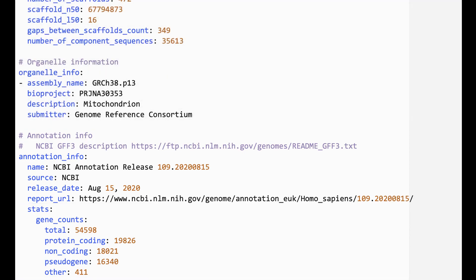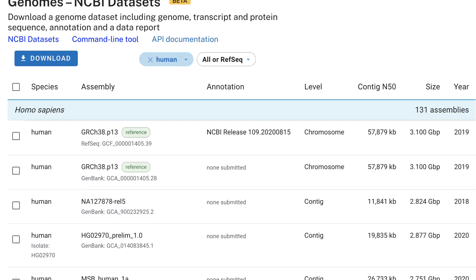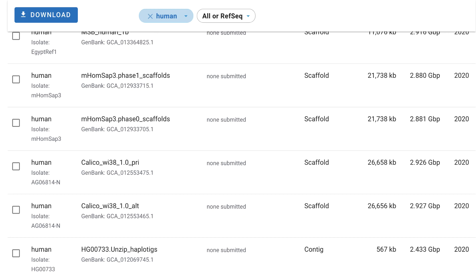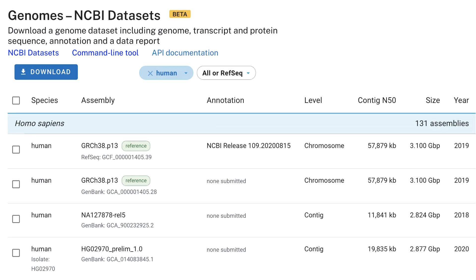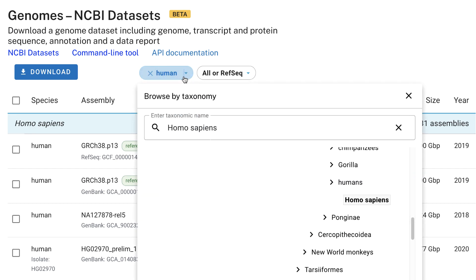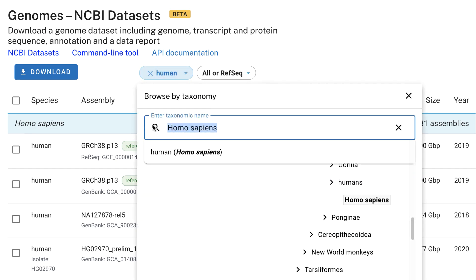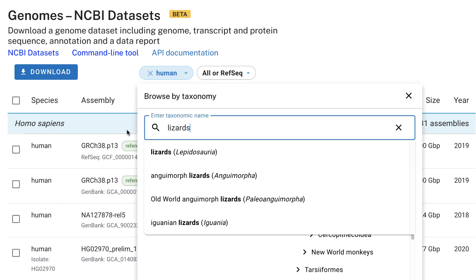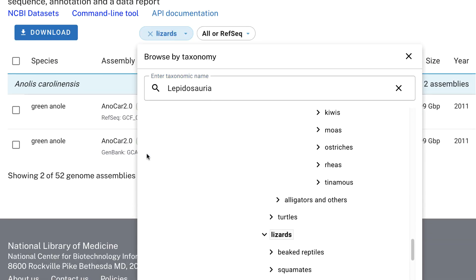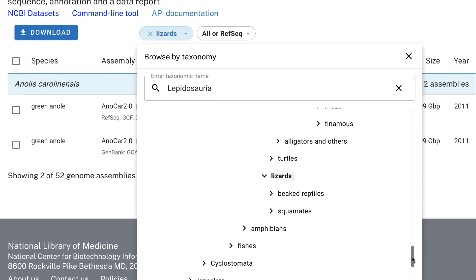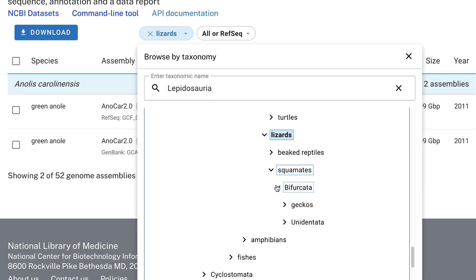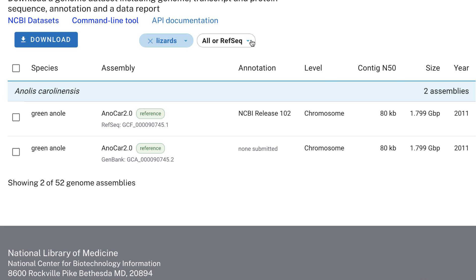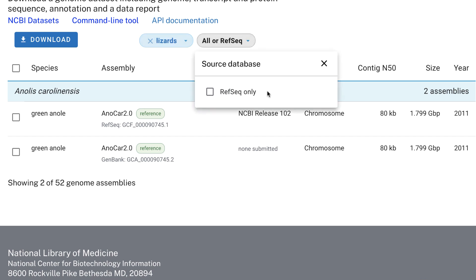If you're looking for a non-reference human genome dataset, you can browse the table. Or if you want a dataset from another organism, use the organism filter at the top of the table to search by scientific or common name. You can also browse the tree to see which groups have assembled genomes, and filter by RefSeq to get the high-quality genomes annotated by NCBI.